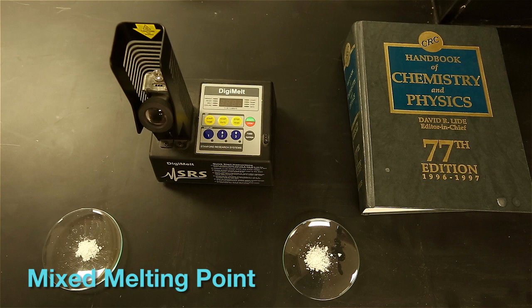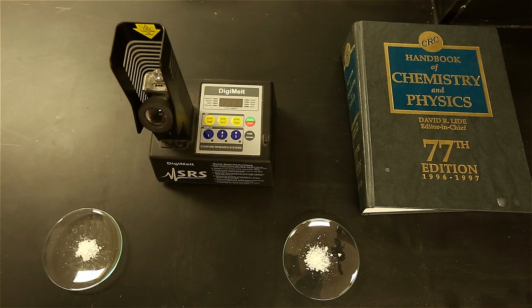When two compounds are mixed, the melting points should be the same if they are in fact the same compound. Conversely, if the samples are not identical, the value of the melting point should be depressed.